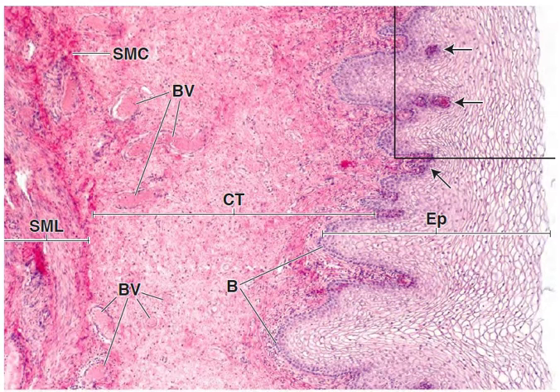So this is the vagina. Welcome to the vagina with Stephen Sparks. Alright, so the vagina is the fibromuscular tube of the female reproductive tract that leads to the exterior of the body, if you didn't already know.